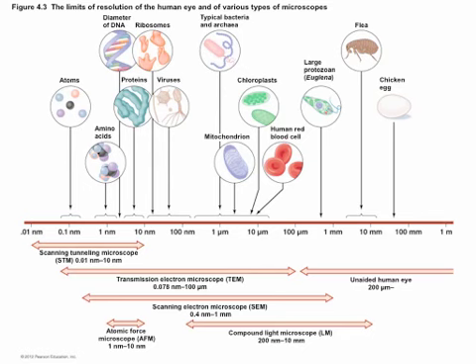Scanning electron microscopes, I've seen pictures of bugs, insects. You get really nice detailed facial maps of creepy little crawly things. At the top end, all the way down at the bottom end to things that are, you know, amino acids, proteins, DNA, certainly viruses.